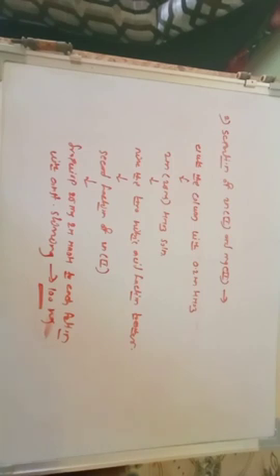We are not so interested in the determination procedure. We are interested only in the separation: how the column is prepared, how the mixture is added, and how the separation of these ions takes place. After that, the determination is very easy because we are familiar with EDTA titration.